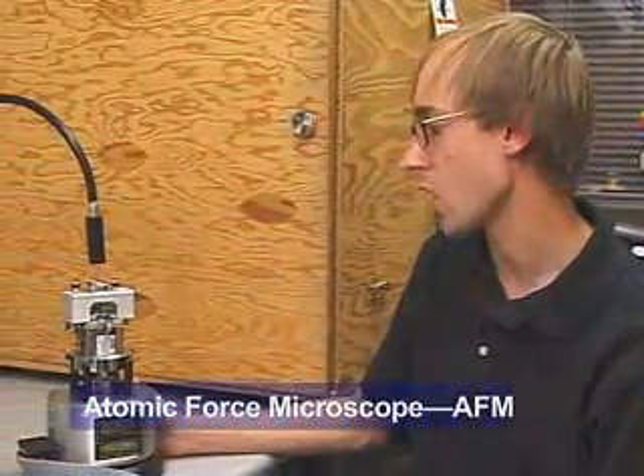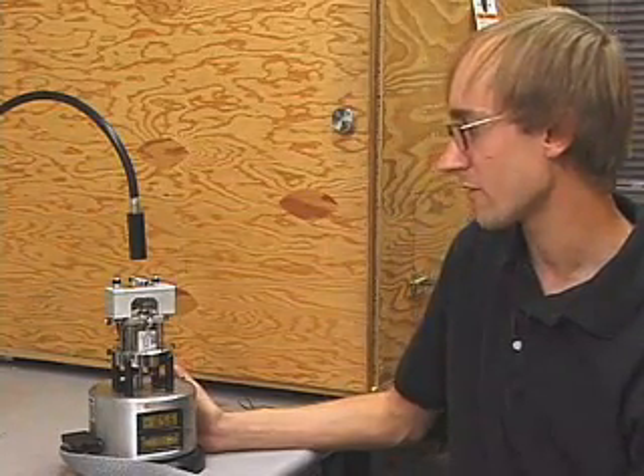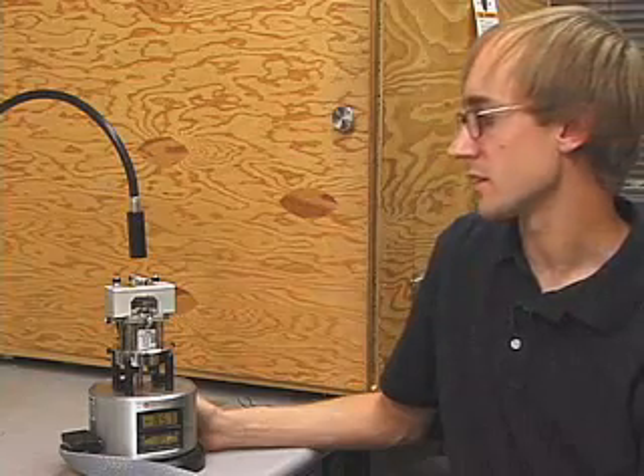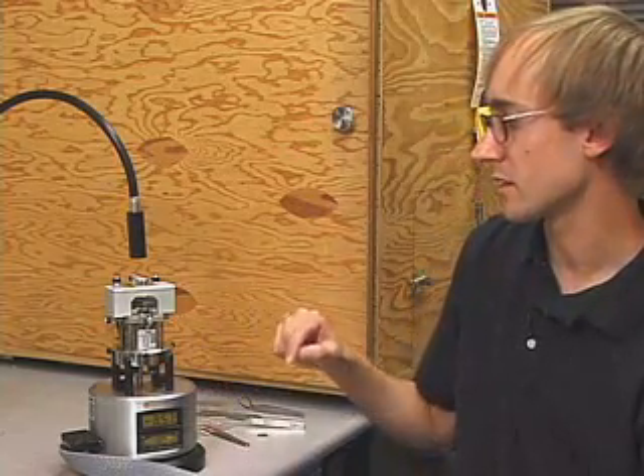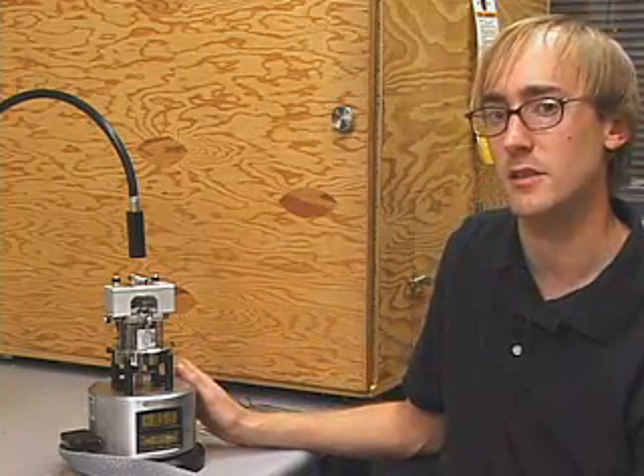The AFM is pretty small, but that's appropriate because it allows us to see very small things. The AFM is a scanning probe microscope. That means it scans a sharpened tip over a surface line by line to give us an image of the peaks and valleys of that surface, or a topography of that surface.